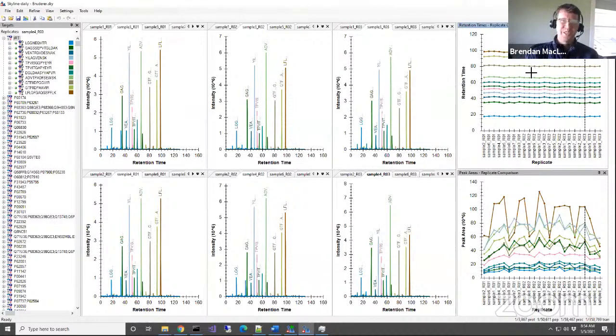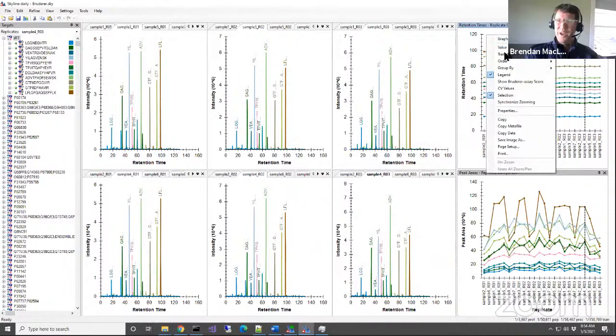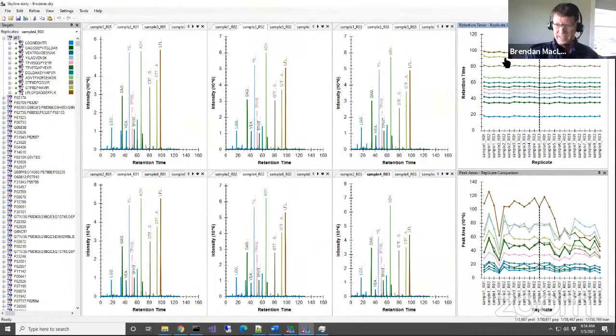The acquired time is a super interesting thing. Once you get a data set you don't know anything about, what can we learn from acquired time? If I order by document, this is just how I put these things into my document, which is a logical ordering with sample 1, sample 2, sample 3. What do I hope to see when I switch to acquired time?